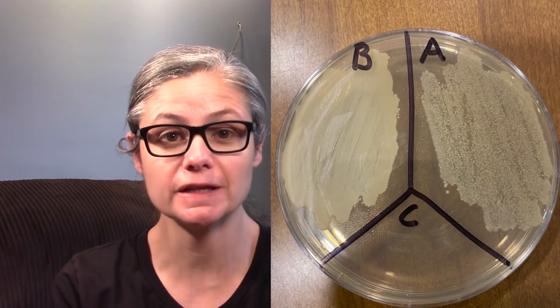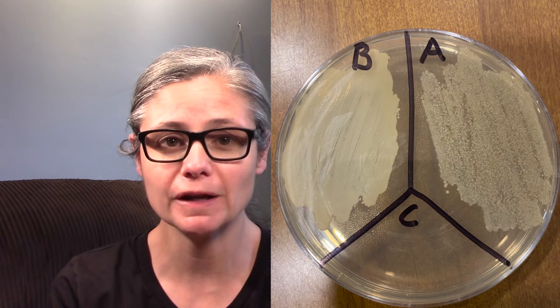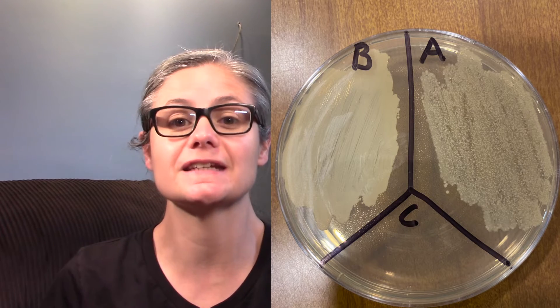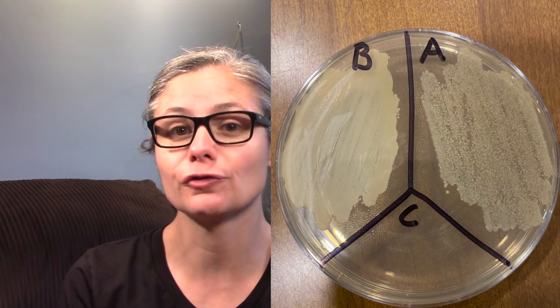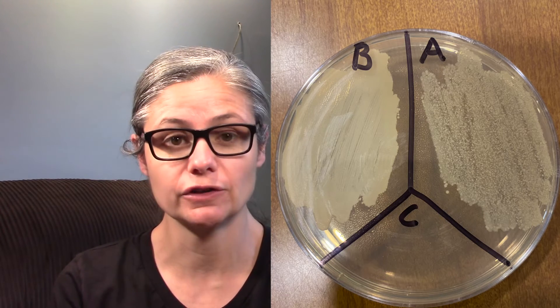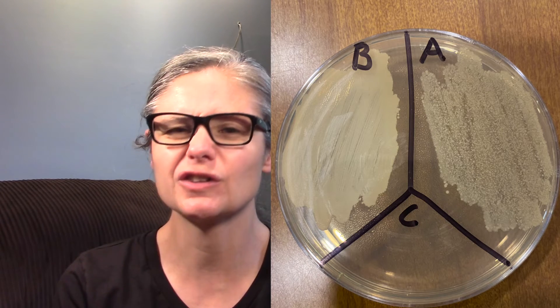Now for some results. Looking at the B section for before, we can see a huge smearing of bacteria — there are so many bacterial colonies that we can't even see individual ones. That's a tremendous amount of bacteria. Then the A section for after — we can definitely see a decrease, but it's really not hugely significant. So in my opinion, hydrogen peroxide does not do a very good job at disinfecting my toilet bowl.